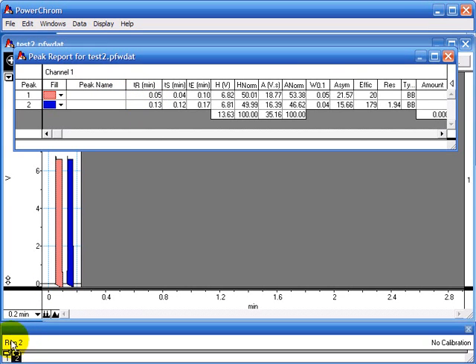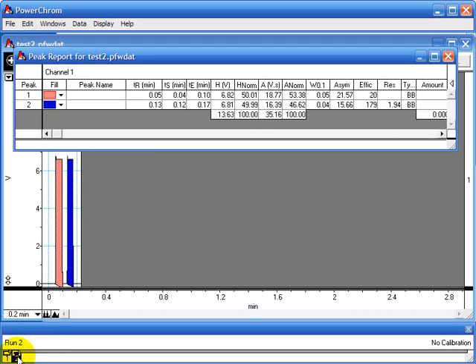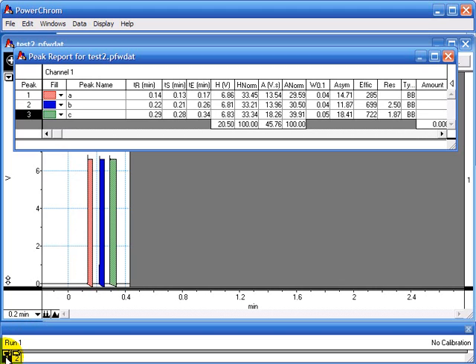This window here shows your runs. So you can collect up to 999 runs in one file. These can be blanks, standards, or samples. And you can click through to see the different runs.